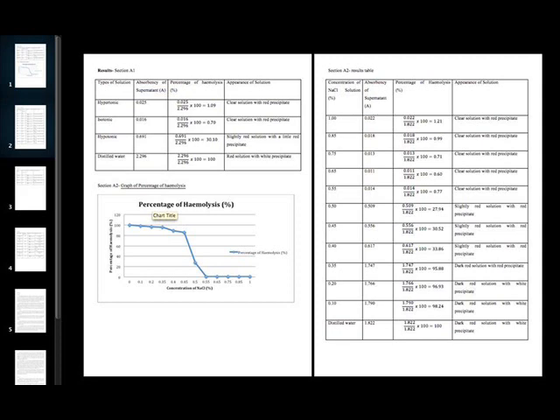Sodium chloride solutions of 0.1%, 0.2%, and 0.35% are behaving like the positive control, and in this section their percentages of hemolysis are close to the one obtained for the control in section A1. The supernatant is a dark red solution with white precipitates present at the bottom of the test tubes. The high percentage of hemolysis somehow indicates that solids in the solution are so few that they are almost negligible, causing net movement of water into the cells and allowing almost complete hemolysis.